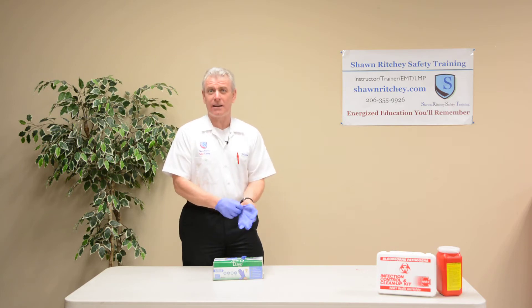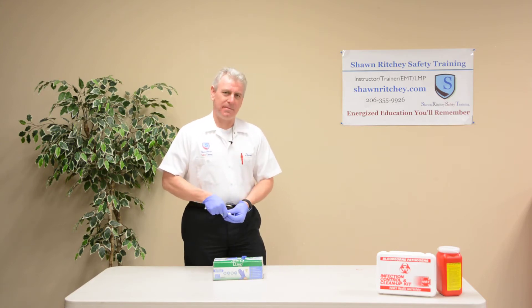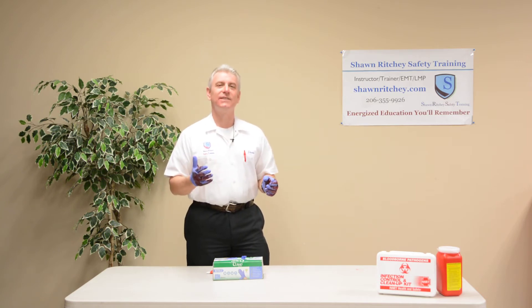What we're trying to do is minimize cross contamination. It's a good idea to use personal protective equipment anytime we think we're coming across some bodily fluid. But how we remove that PPE is just as important. I'm going to teach you what I'll call glove-to-glove and skin-to-skin.